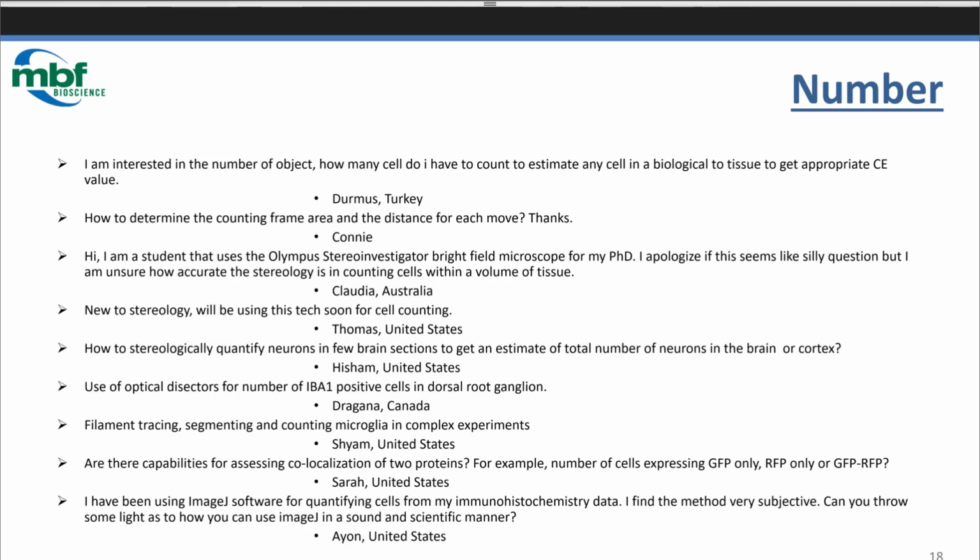Shyam's interested in filament tracing. That's more for another webinar. We have a program called NeuroLucida that can trace processes in neurons. We are working on bringing a neuroscience forum to you.